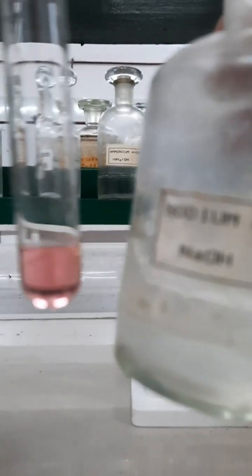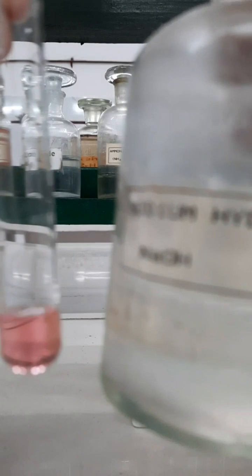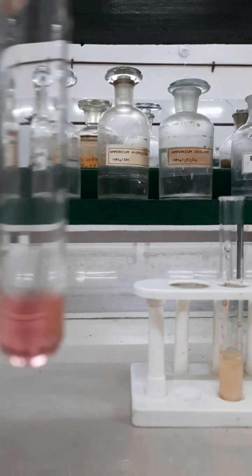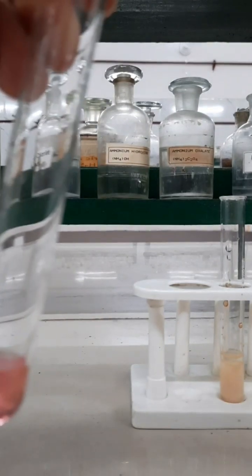Now let us perform a unique test exhibited by the cobalt 2+ ion. Here is an aqueous solution of cobalt 2+ ion and I am adding sodium hydroxide solution into it and recording the observation.